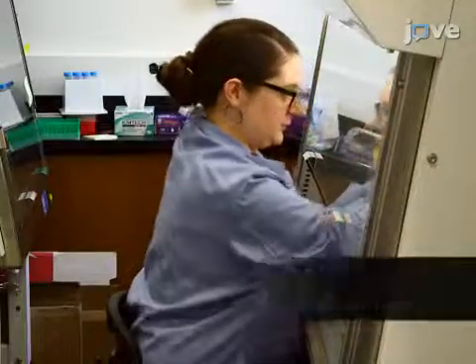Generally, individuals new to this method may struggle, because removing the backing of the double-sided tape that holds the cell-capture membrane to the side of the PCR tube requires practice. Demonstrating the procedure will be Jen Reed, a senior technician from my lab.